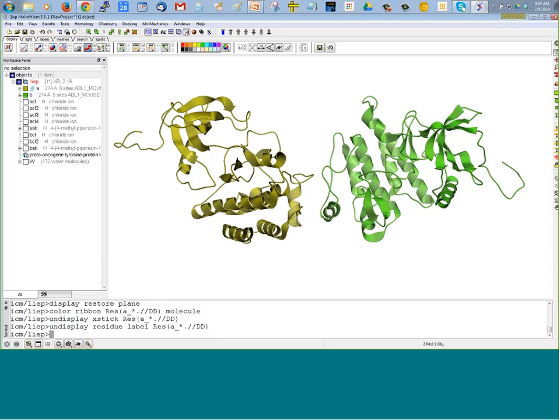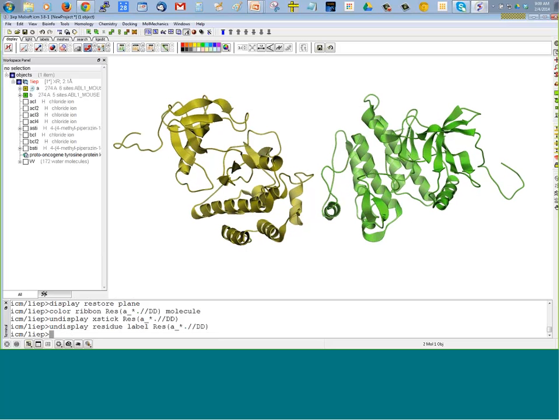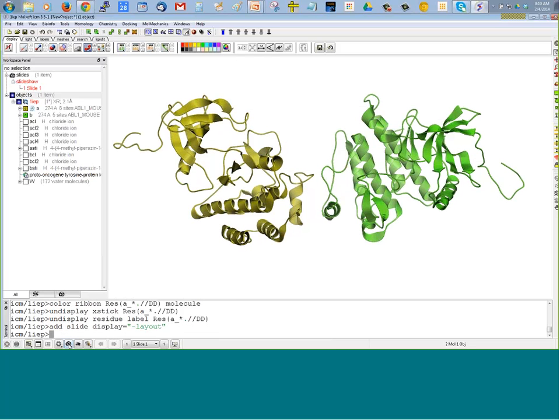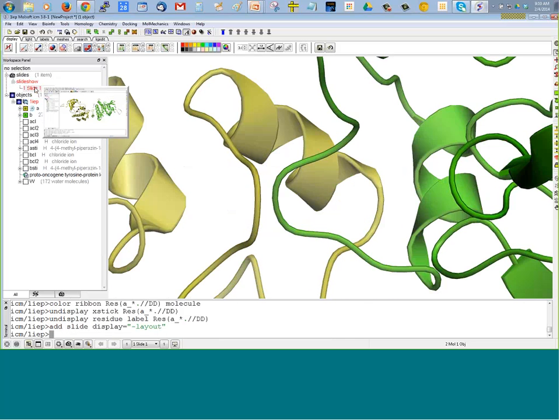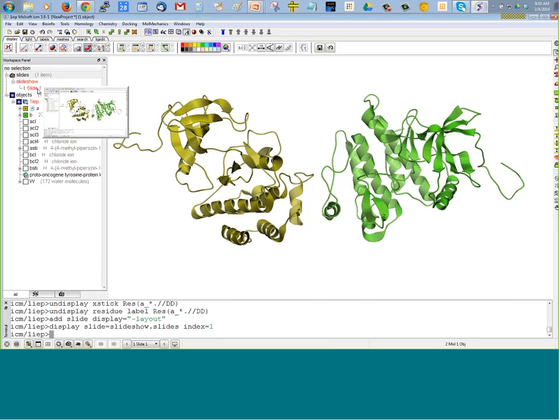If you want to save this viewpoint and rendering and all the information in this one image, we can click on this slide button here. Down at the bottom of the screen, it's like a camera button. And you can see that we now have in the ICM Workspace one slide. So basically that means if we zoom in, zoom out, we can always return directly to that slide by double-clicking on the slide button here. So it's stored all that information in one slide.